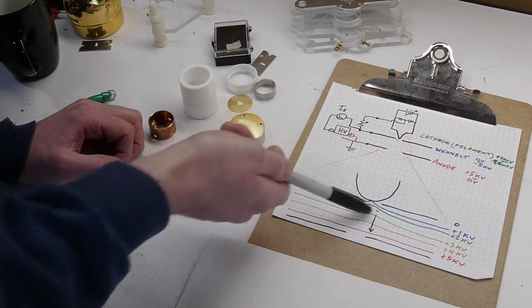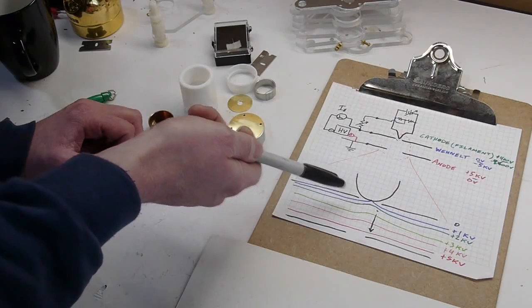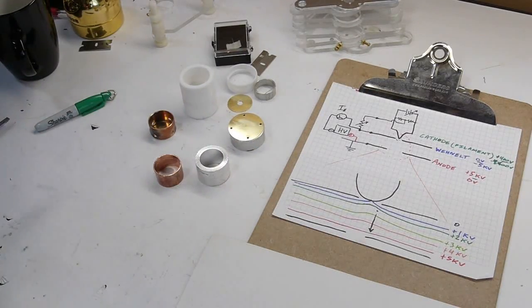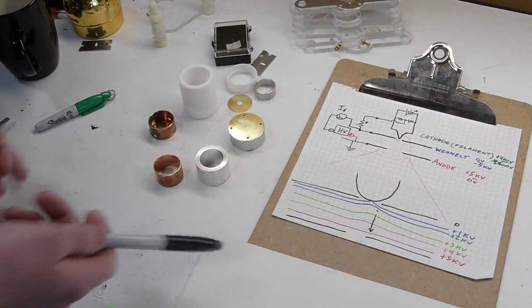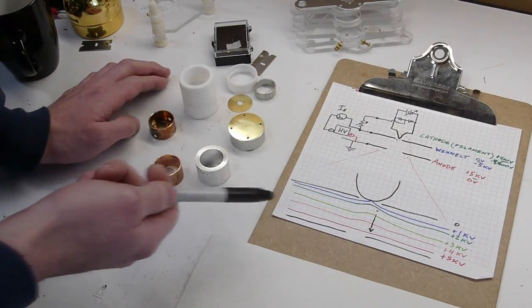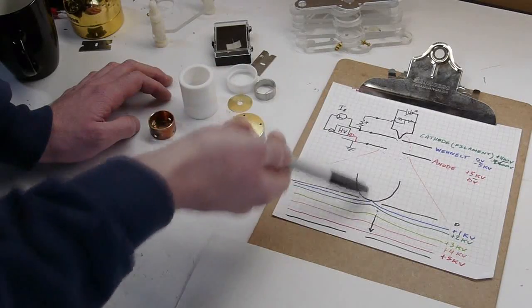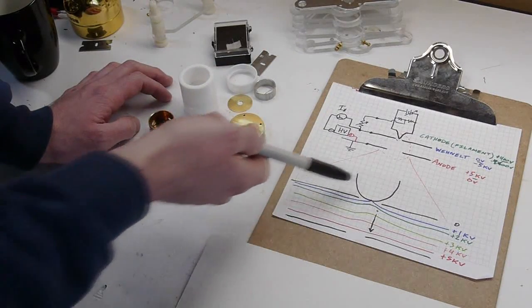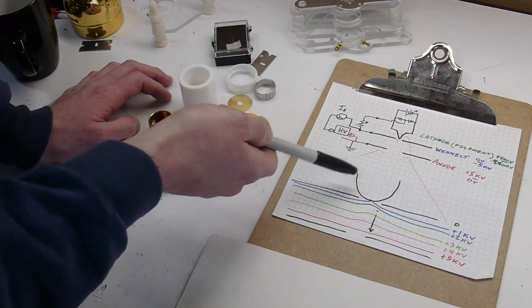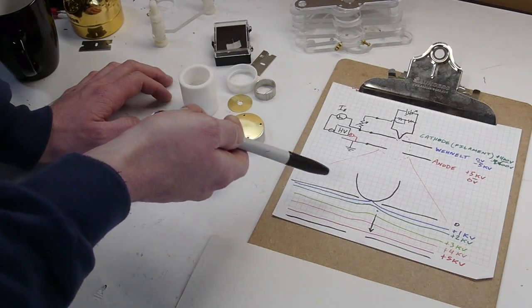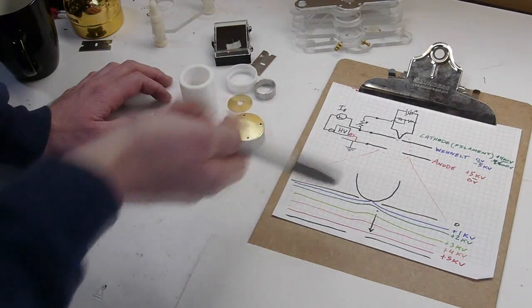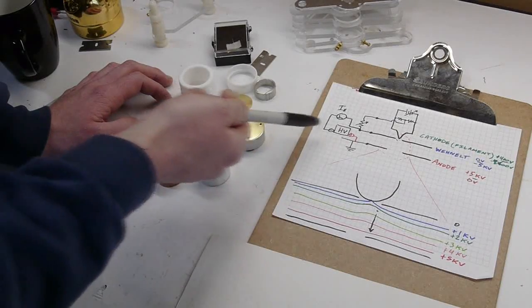So if we look at the two extremes of the situation, we either have no electron emission or tons of electron emission. We can guess that if we set this value to be something appropriate, we can actually control the electron emission by regulating the voltage between the filament and the Wenelt. So it's some happy medium. And in this case, with these sizes and voltages, it comes out to be on the order of a couple megaohms.